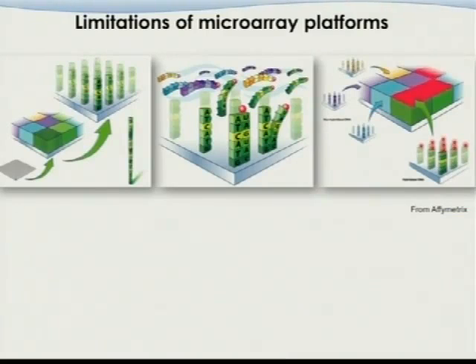And then if we zoom in on this area, this is what it will look like. In one compartment, there will be a lot of small oligos standing there, and they are all the same. They are designed to target a certain gene, meaning that they are reverse complementary to the RNA molecules in those regions. So this is the array design.